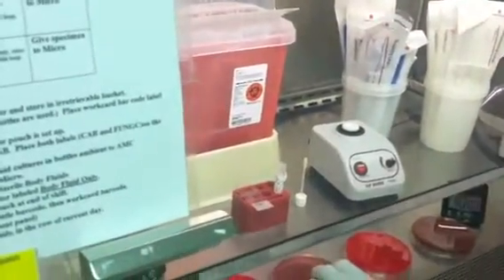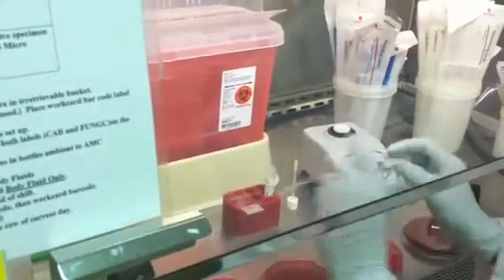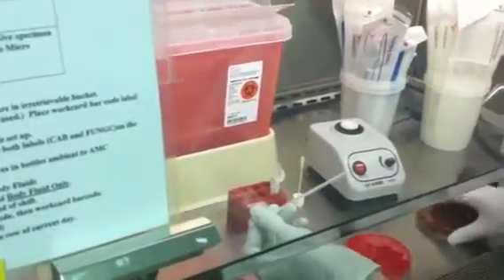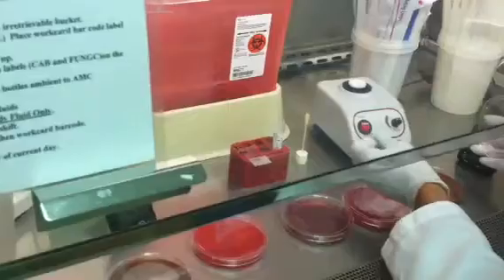All of the wound cultures, sterile cultures, et cetera, will now use an individually wrapped sterile pipette opposed to the pipettes that we normally would use. And then you're just going to drop a drop of the media on each plate and streak it out like you would do any other culture.